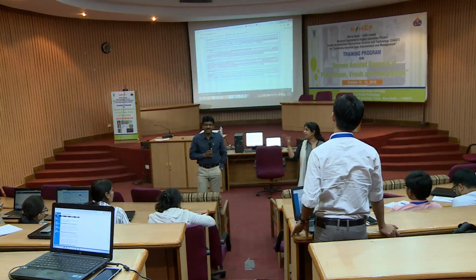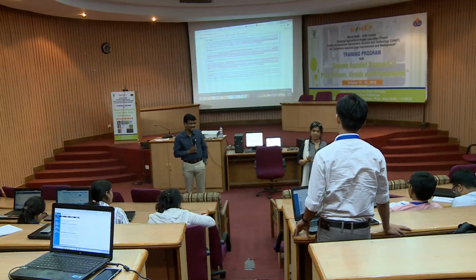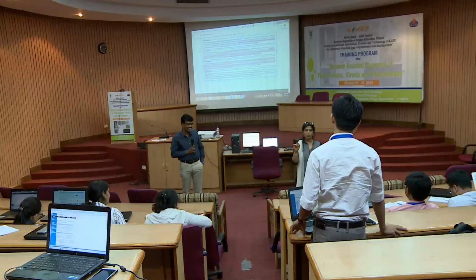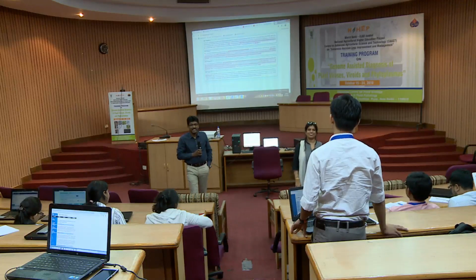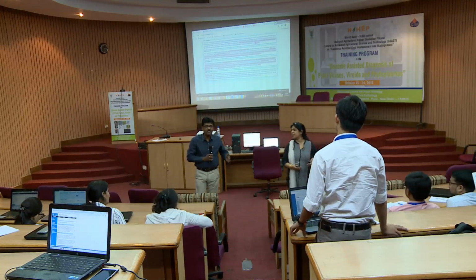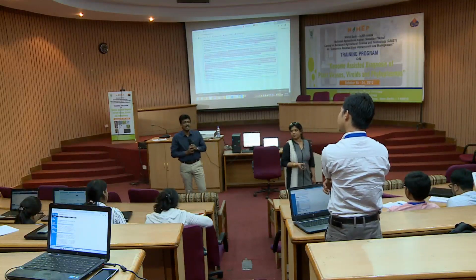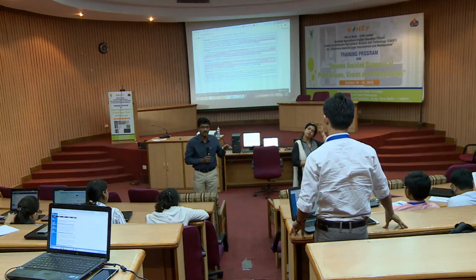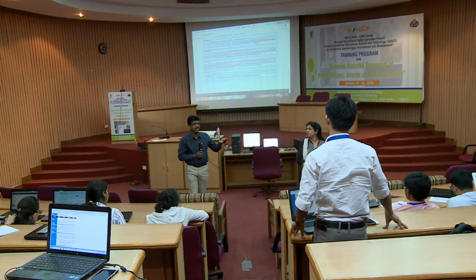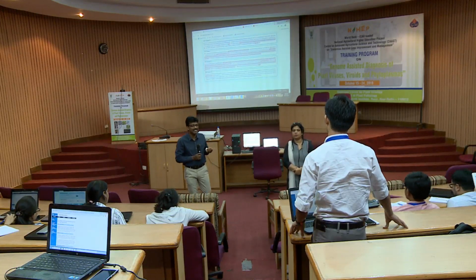Maybe the earlier entries must be there, but right now we have faced this several times: if any problem is there at any point, they will not give you an accession number, so how will those entries go there? Yeah, the databases are populated by all of us, correct? And there is a saying, sequence generation from an organism whose phenotype is not well characterized, technically you cannot upload that data in GenBank, right?